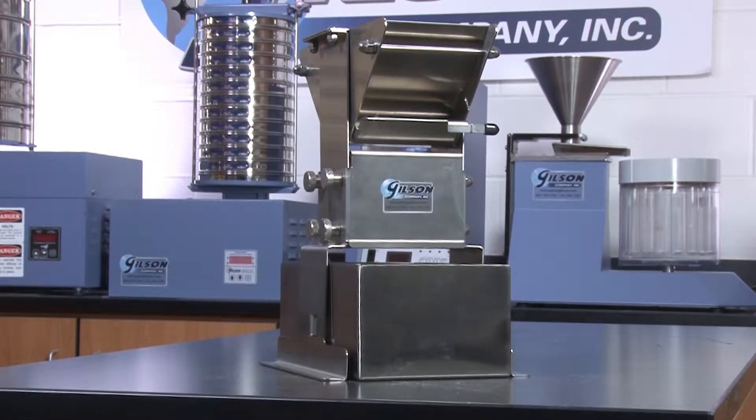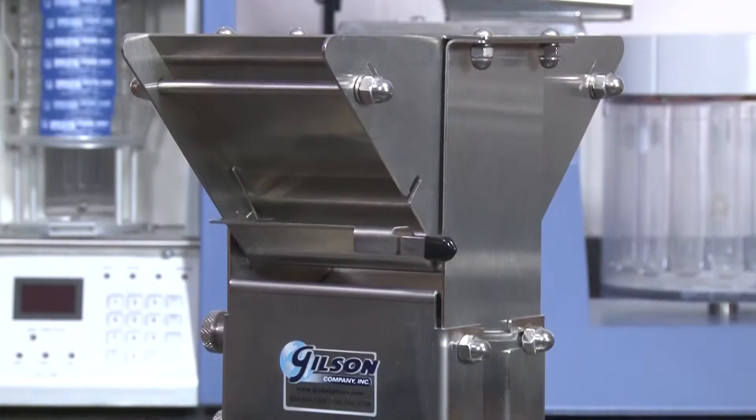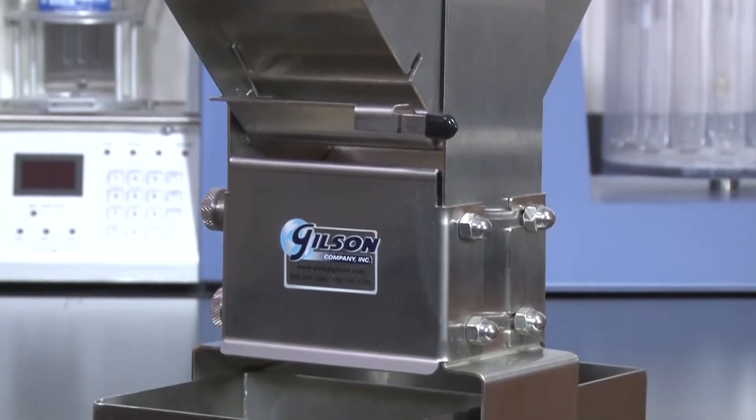These riffle-type precision splitters are made of heavy gauge 304 stainless steel to avoid potential sample contamination and corrosion.